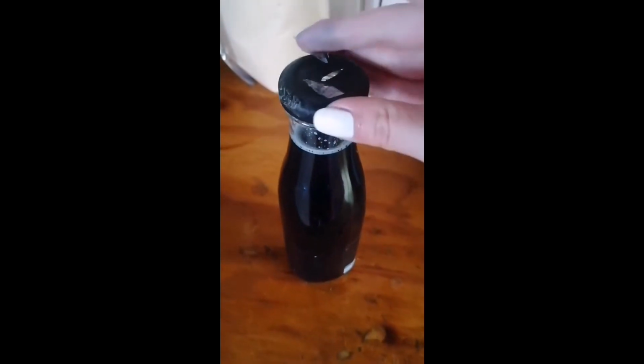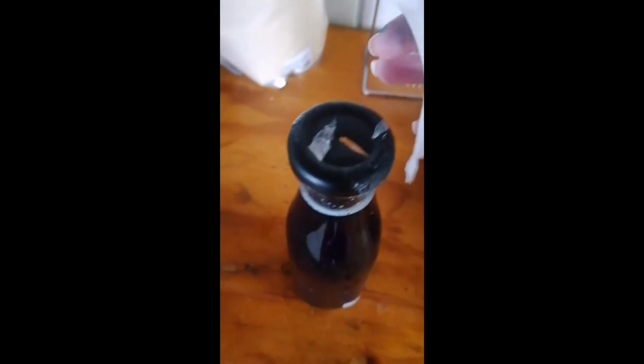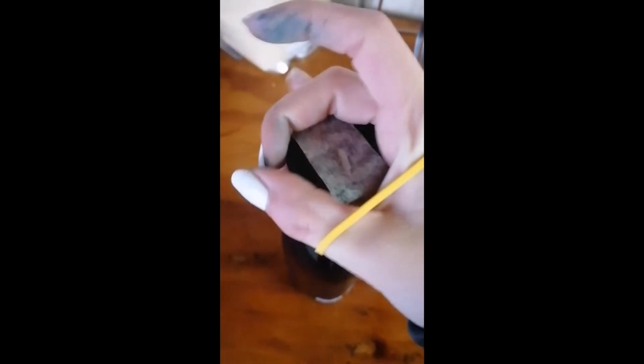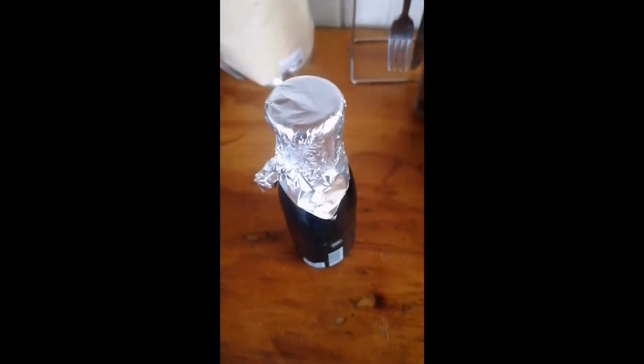Okay, I did pour some agar out and now I am attaching the lid. There is a hole on top, so we will add some micropore tape over that. This is just to help with the steam and everything. So just close it up and then we're going to add some aluminum foil over here and then we're going to secure it with a rubber band.